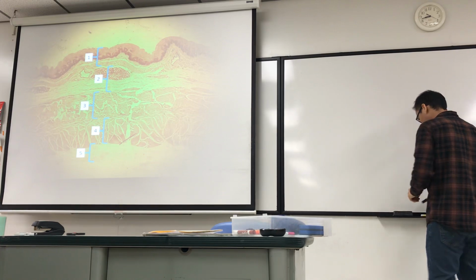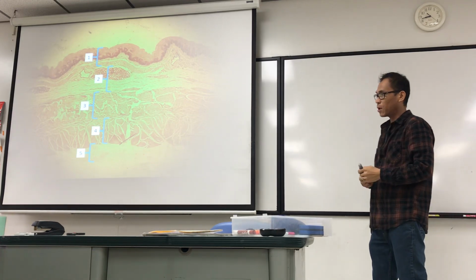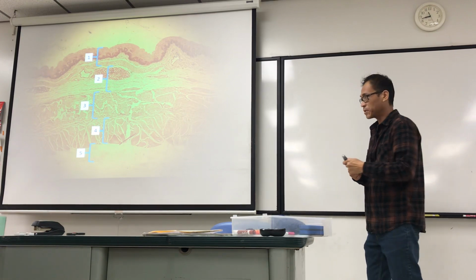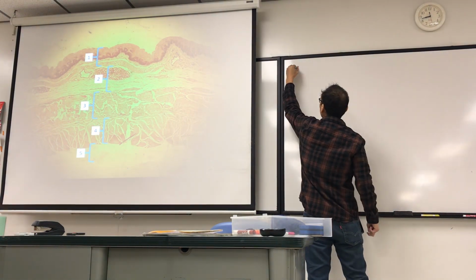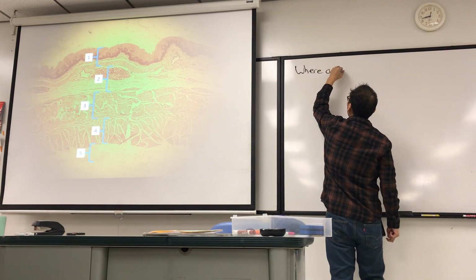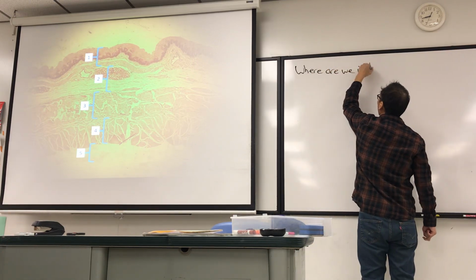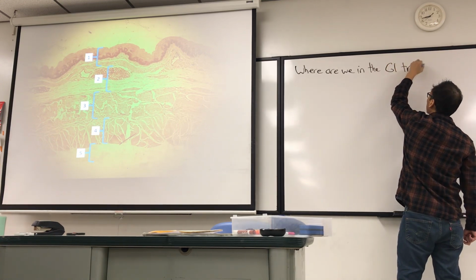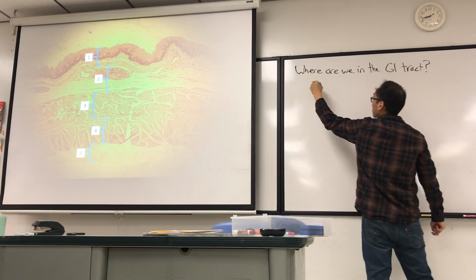So as you prepare for this histology quiz, think about 4 locations. Always ask yourself, where are we in the GI tract? We're going to start in the esophagus.